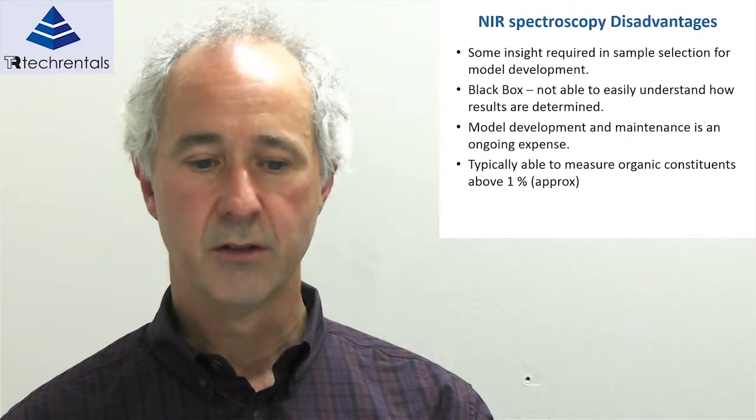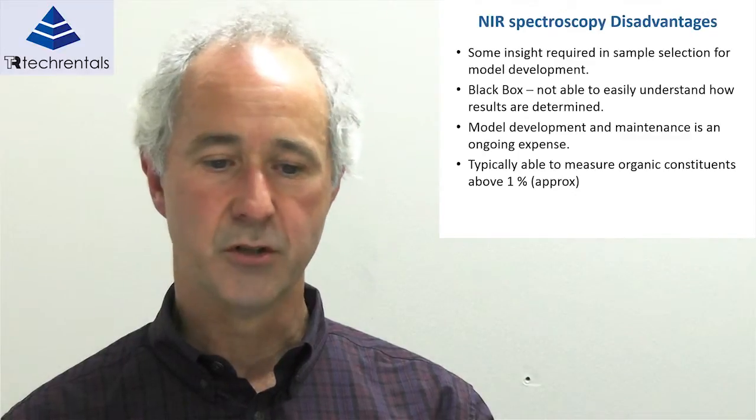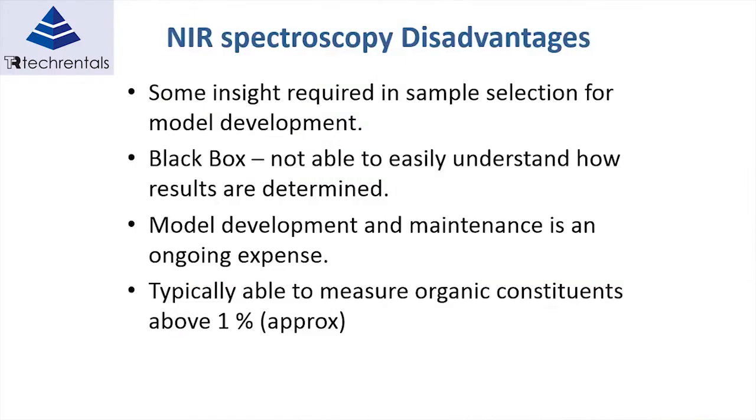For instance, the acid I talked about before in fruit, or orange juice, being typically less than 1%, is more difficult to determine. Although I'd say that this is improving, as there is a lot of research being done to measure components down to levels a lot less than 1%. I'm sure you'll see this improve as time goes on.